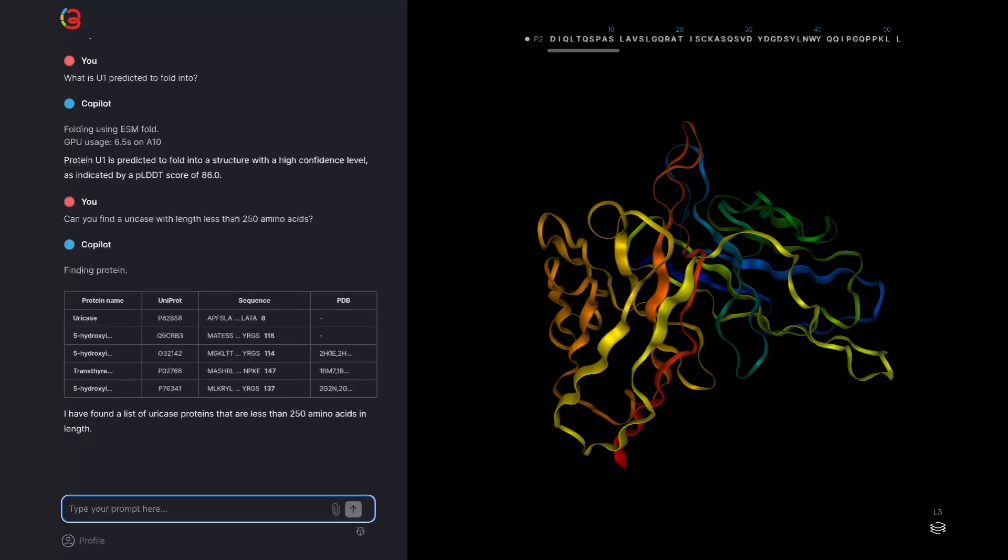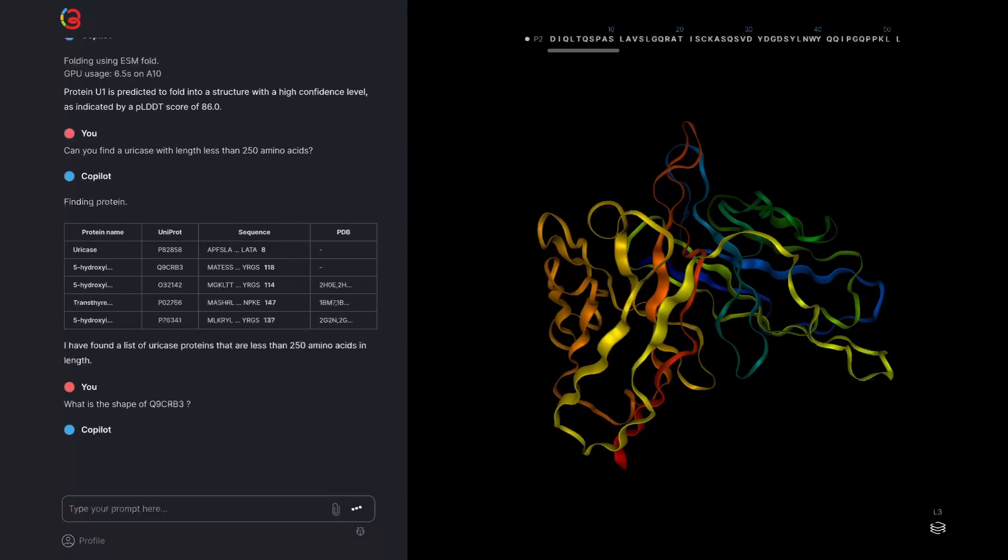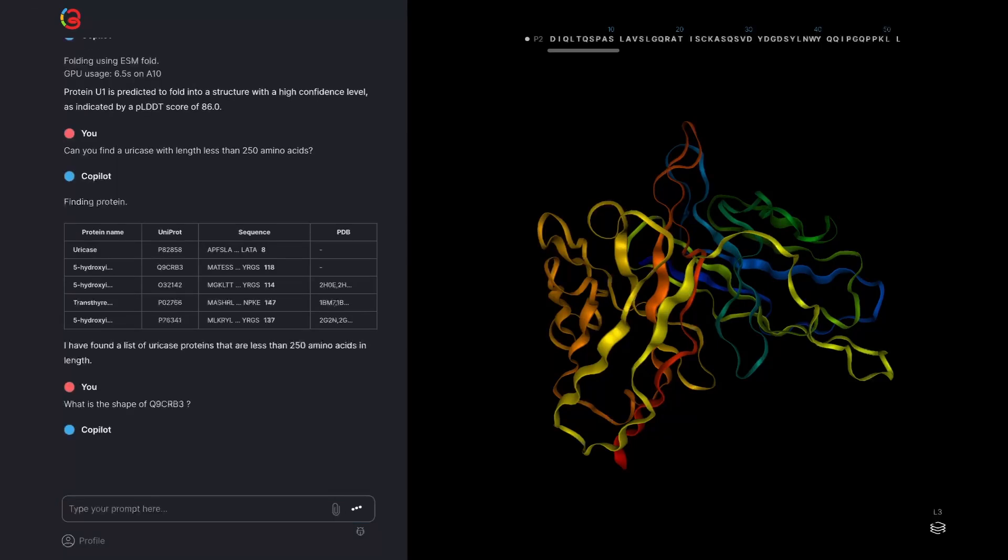From there I can ask for the structure by the Uniprot ID. For example, what's the structure of Uniprot ID Q6DG85.